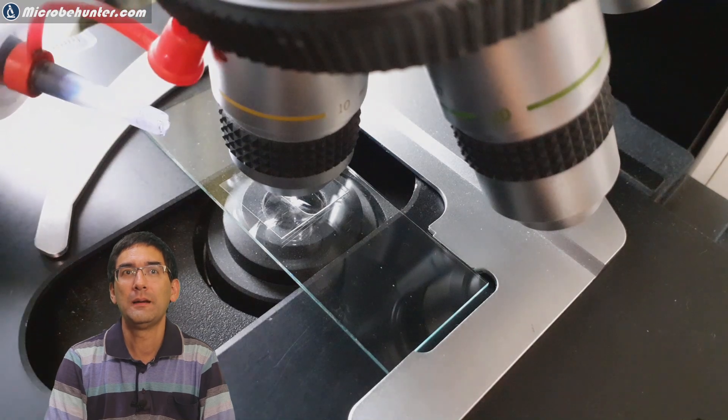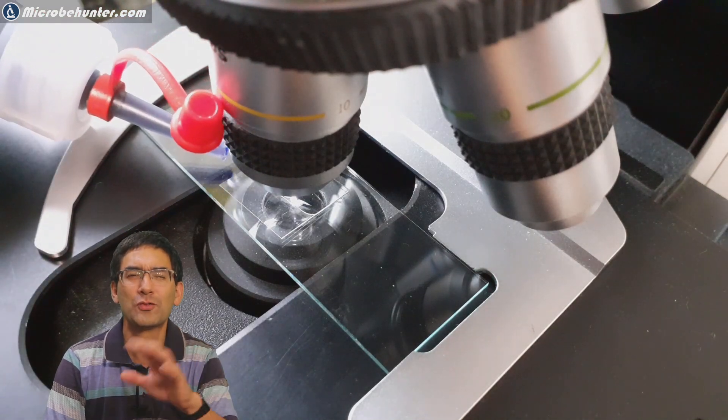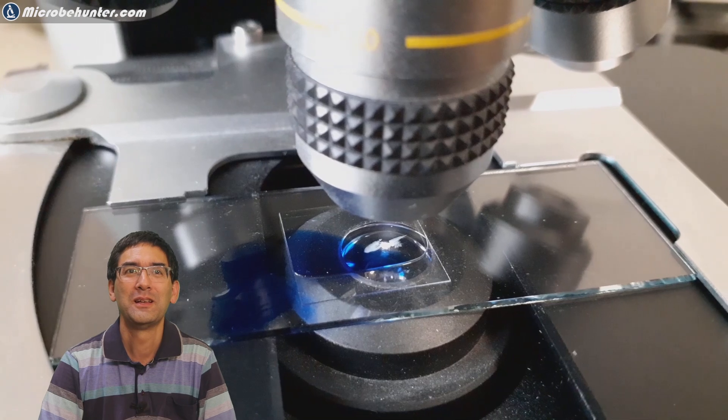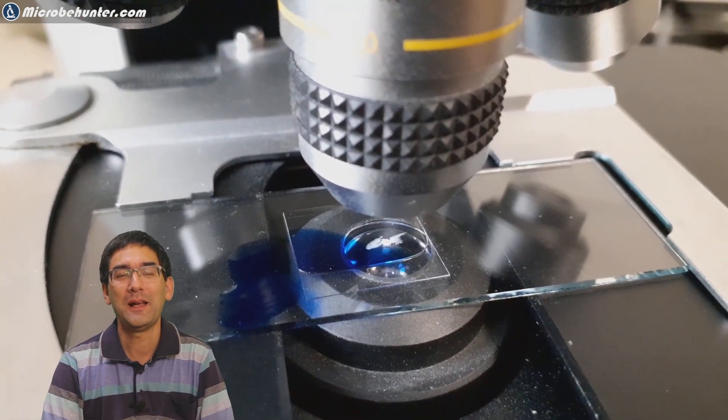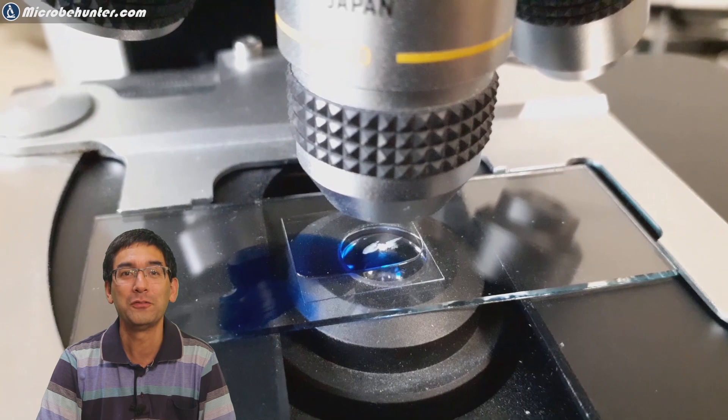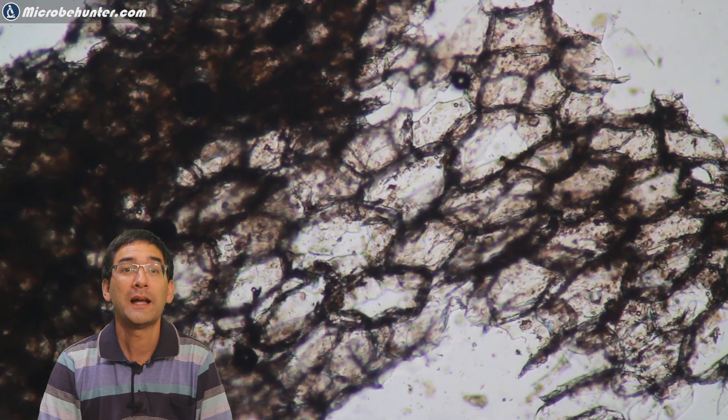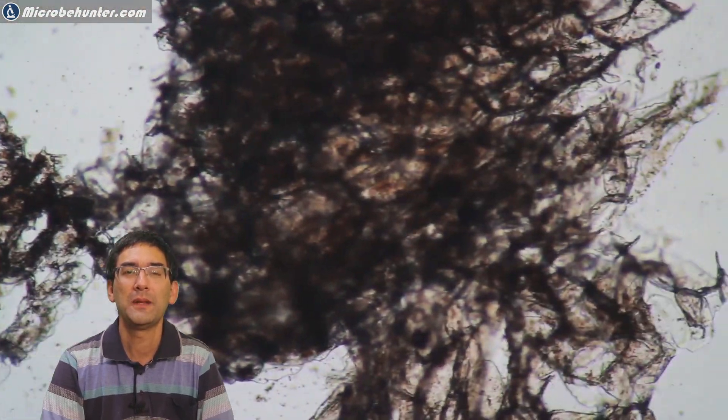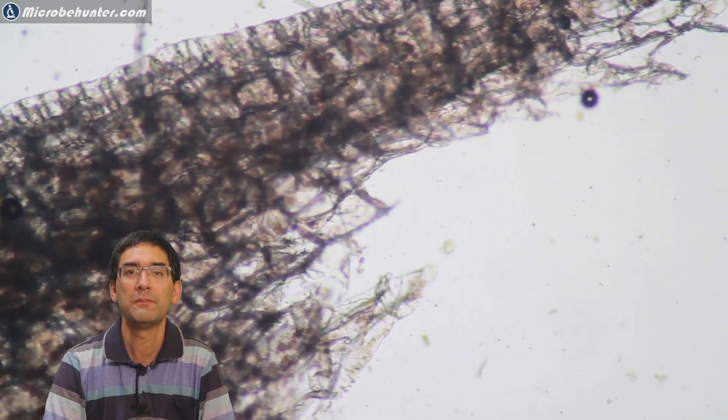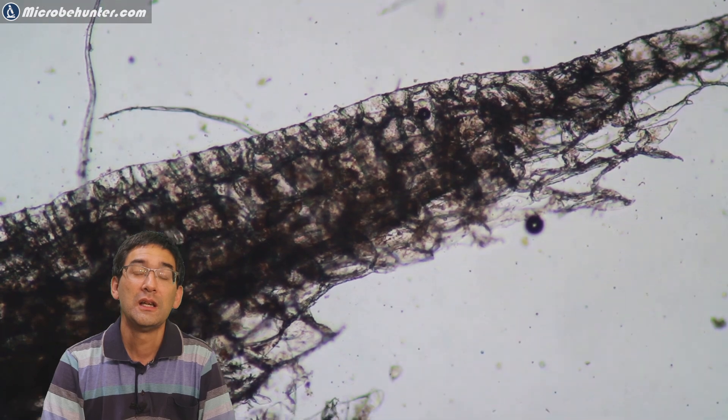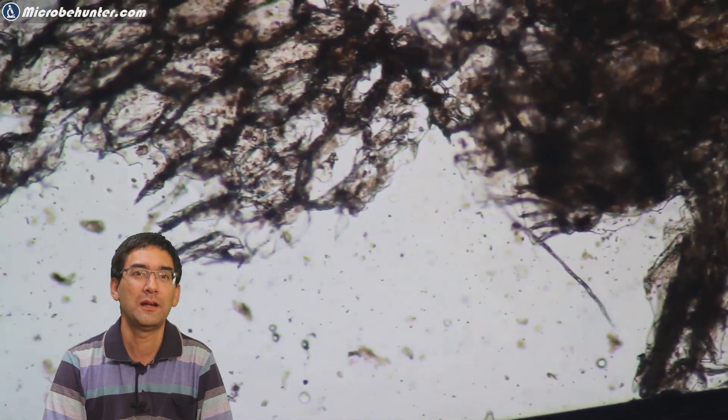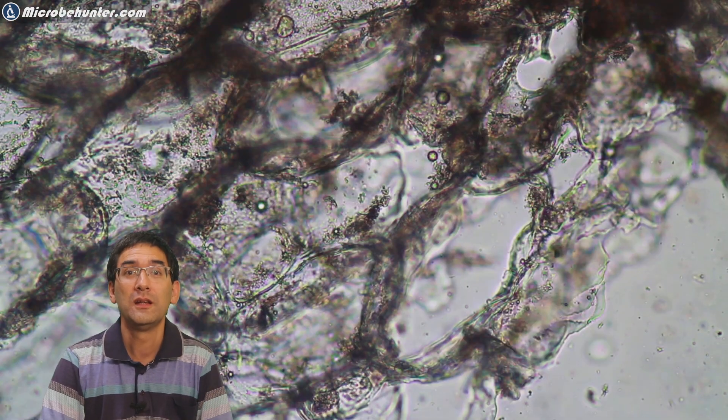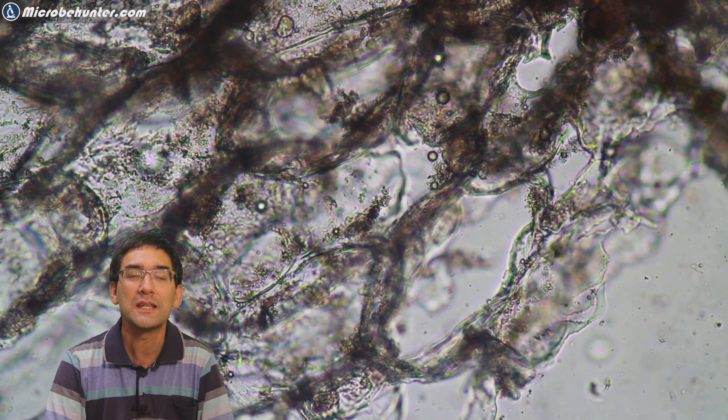It goes under the microscope. I again added a little bit of methylene blue, being extremely careful not to touch the objective. In this case I allowed the methylene blue to flow beneath the cover glass. I've done this quite often because I wanted to see how the different plant materials react with the stain. Very typical for onions - again, very large and thick cell walls visible. I was a little bit disappointed that I was not able to see the nice regular structure of the cells that I'm used to seeing when I put onion skin under the microscope. But it's fine. After all, I did have to prepare it using my scissors and this was quite difficult to do.